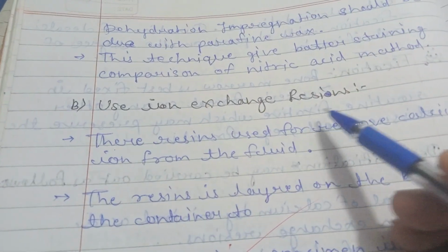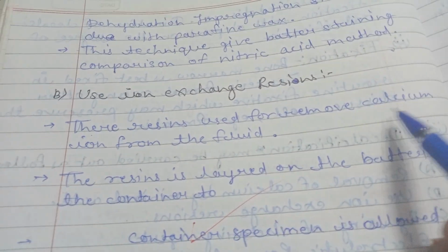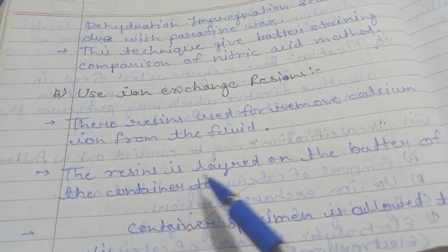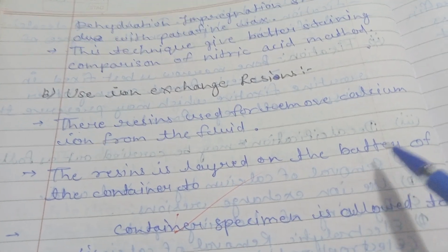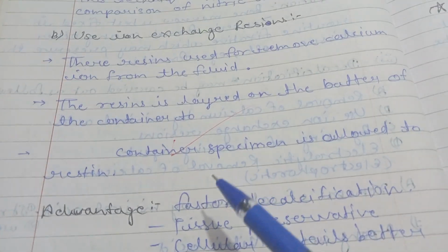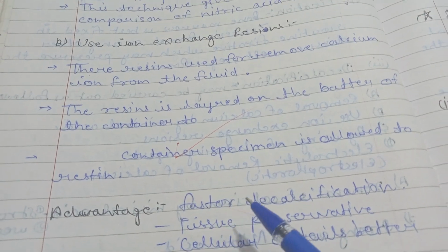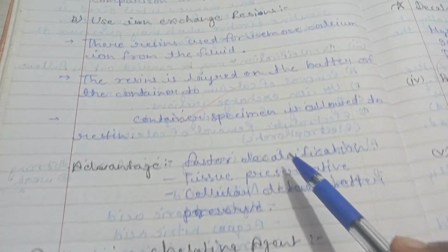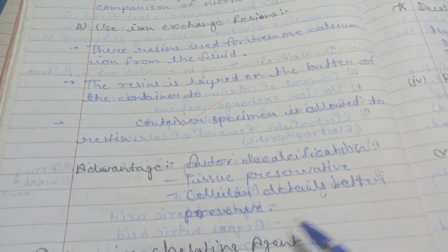Use of ion exchange resins. These resins are used to remove calcium ion from the fluid. The resin is placed at the bottom of the container, and the specimen is allowed to rest in the container. Advantage: faster decalcification, tissue preserving, cellular details better preserved.